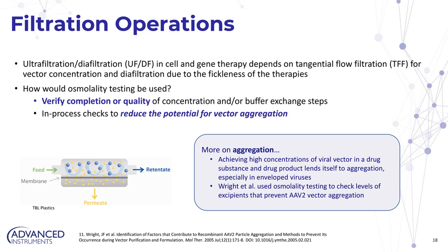And my answer is, osmolality testing is a great way to verify the completion or the quality of either your concentration steps or buffer exchange steps. So as you're exchanging buffers, depending on the number of diavolumes you're using, it's great to take the osmolality measurements at each of those stages, maybe every 2 diavolumes, to ensure that you are successfully moving from one set of buffers to another.